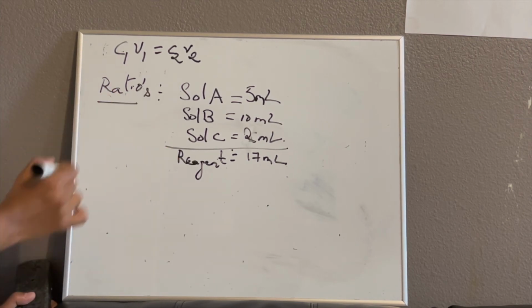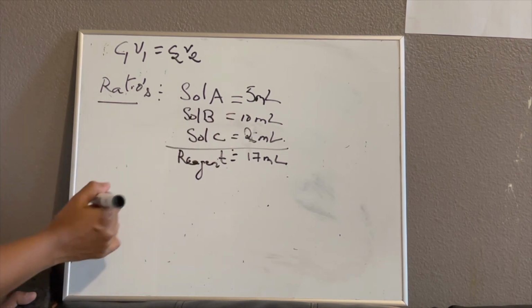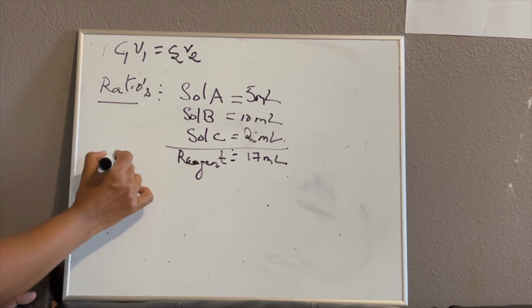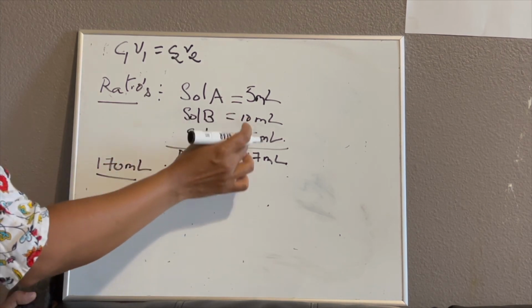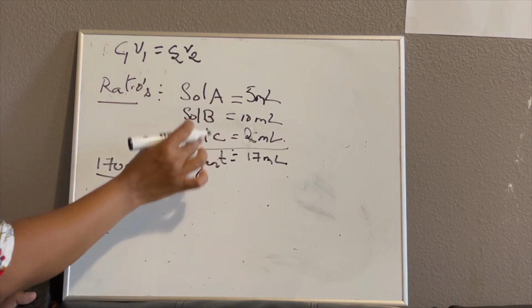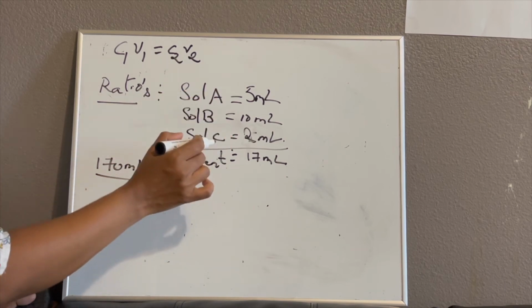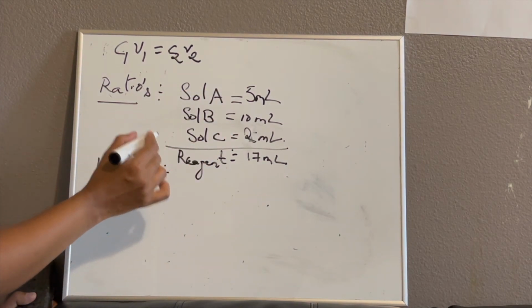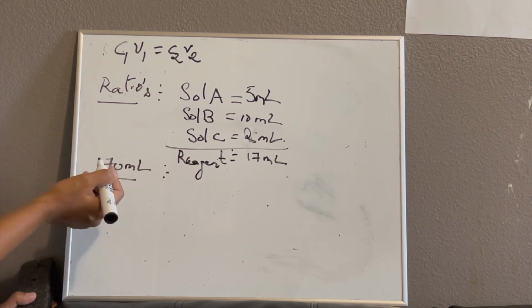So for that day, for your assay, for your experiment, how much of the detection reagent do you use? For example, if you want to make 170 ml required for your use that day, you have to add each solution correspondingly. It is very important to mix the ratios accurately, and this is very often the case in any lab with most of the detection reagents.